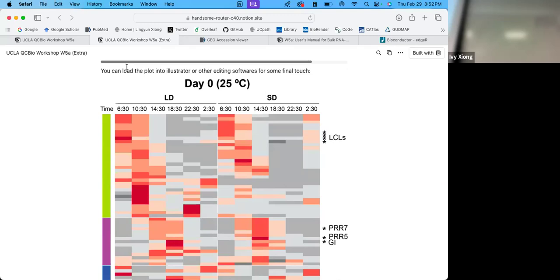Apparently something is going on right now, you cannot find our script as a function or as software in the prompt. With the website, we can supply them. Then I submitted my job.